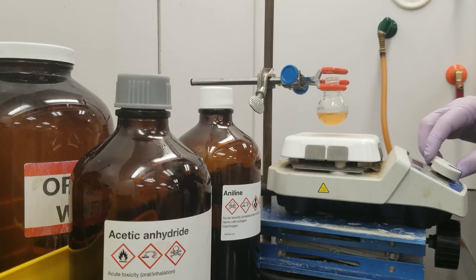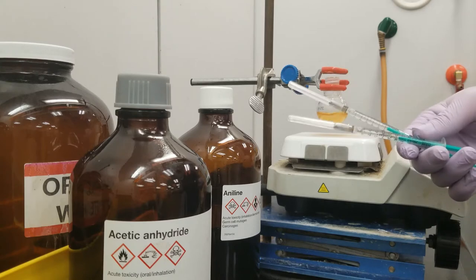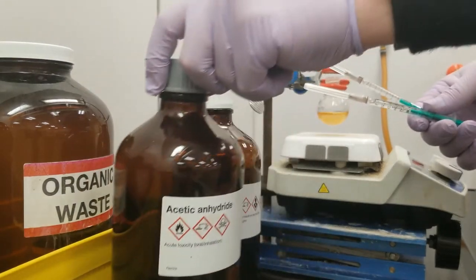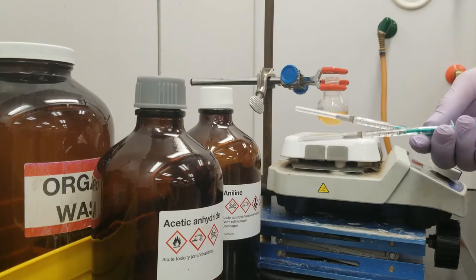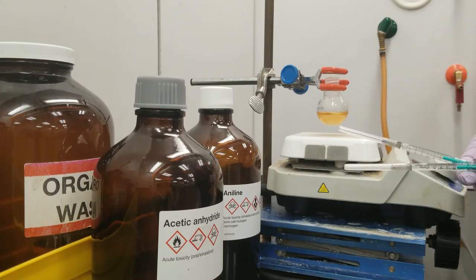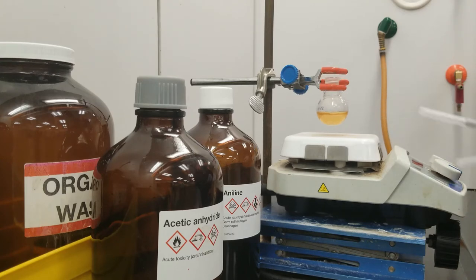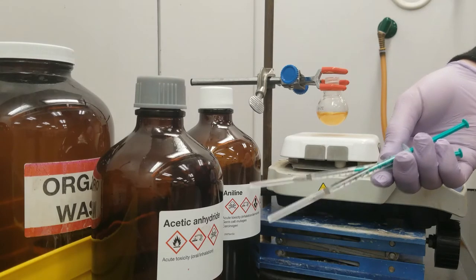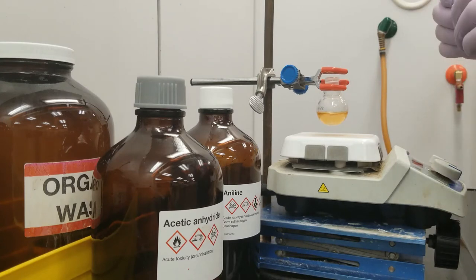Let's go ahead and start stirring this nice and fast. I always stir as hard as I can without splashing. To this reaction, we are going to add 1.4 milliliters of acetic anhydride. This is a species which reacts quickly with air or anything with a polar moment and ends up adding an acetyl group to that positive center present on the water in the air, or today in this case, the aniline. Because this is rather reactive, it's important that we drip it in slowly.